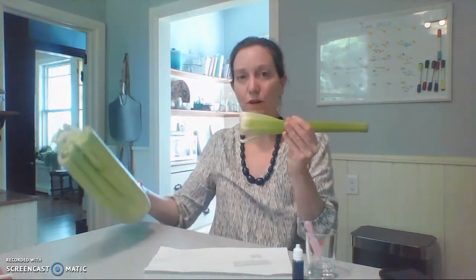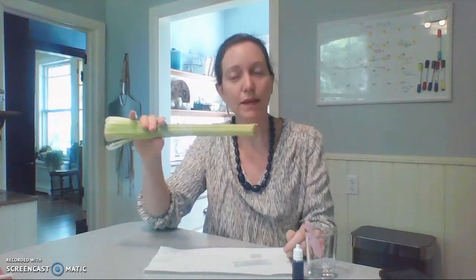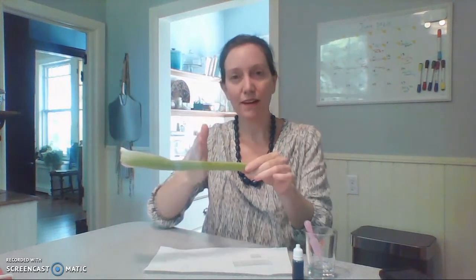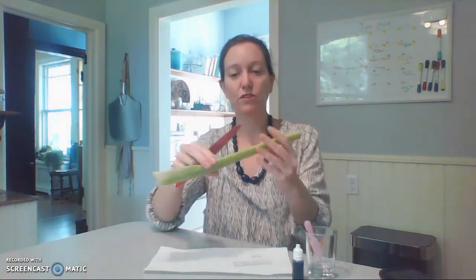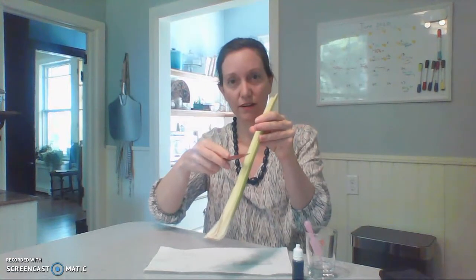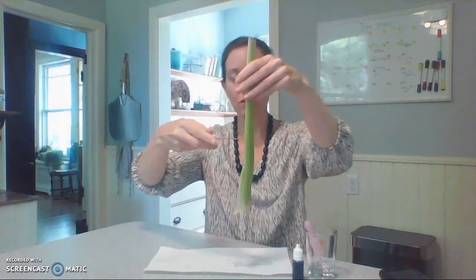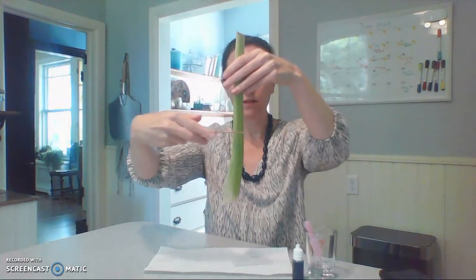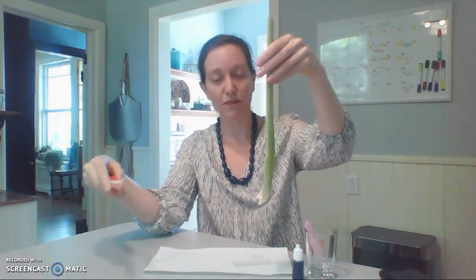When you make a slide of biological tissue, the key to doing it successfully is to make your specimen as thin as possible. We want to make a very thin slice through the celery. We are going to do a cross-section slice and a longitudinal slice. Cross-section goes horizontally through the organism. With cells or tissues this can get a little tricky, but with celery it grows like this.